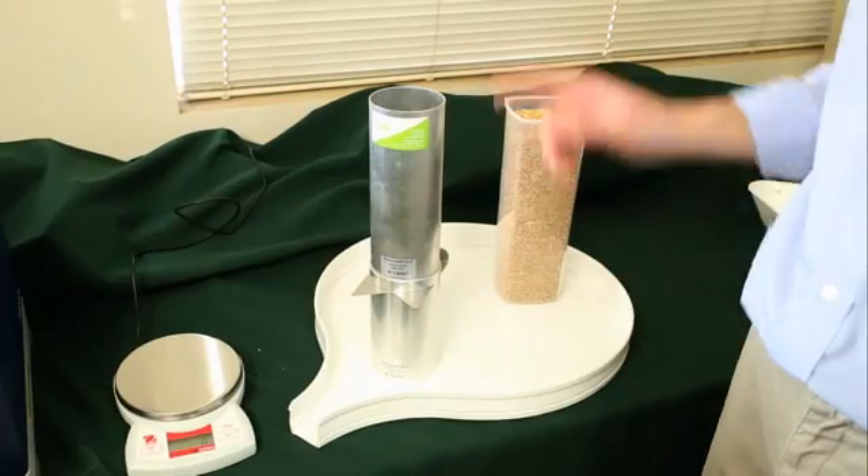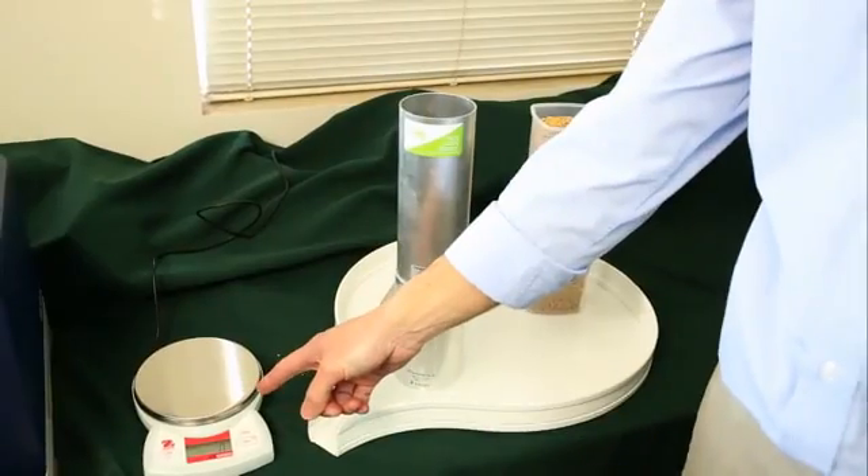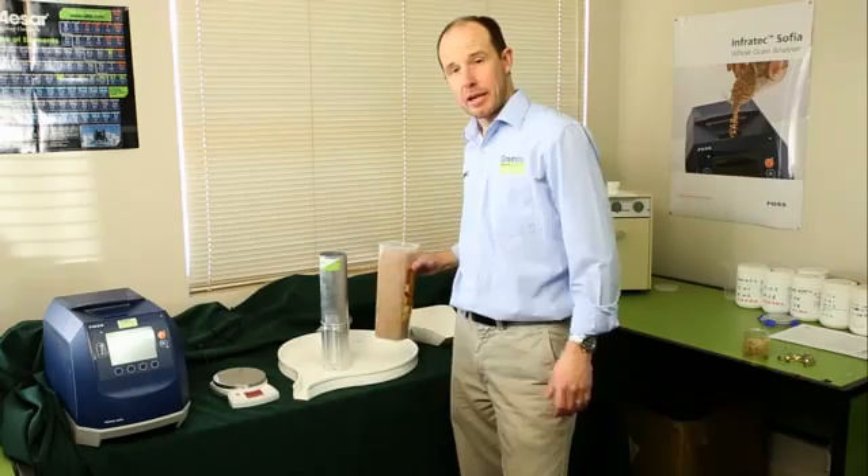G'day, this is a little tutorial on how to measure test weight. You'll need a chondrometer and a weighing balance and a sample of grain.